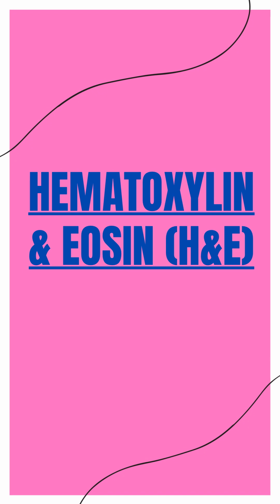Conclusion. H&E staining is a fundamental technique in pathology, allowing pathologists to visualize and analyze the microscopic structures of tissues. Hematoxylin and eosin, the key components of this staining technique, impart characteristic staining patterns to nuclei, cytoplasm, collagen fibers, and other cellular components, aiding in the diagnosis of various diseases and pathological conditions. As a cornerstone of histological analysis, H&E staining continues to be an indispensable tool in medical research, diagnosis, and education.